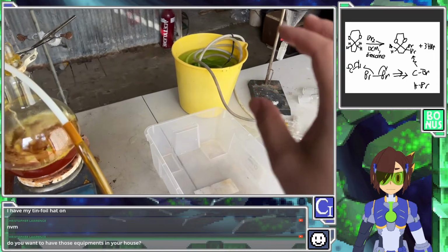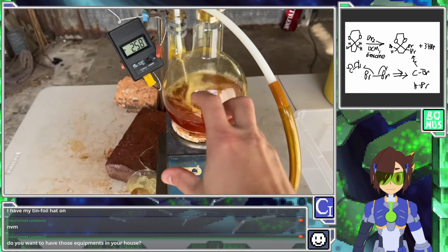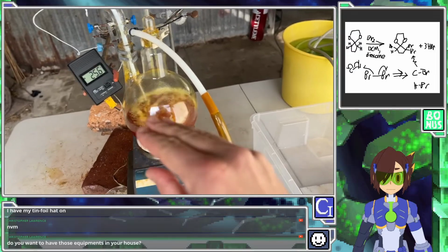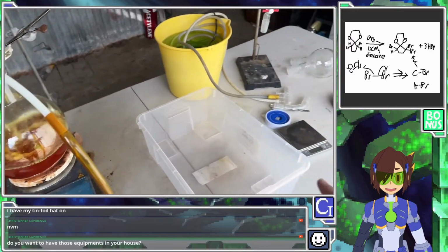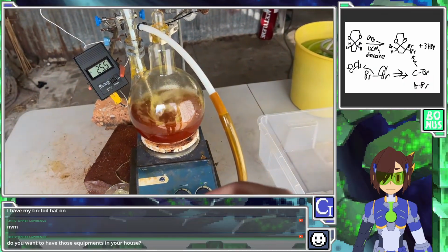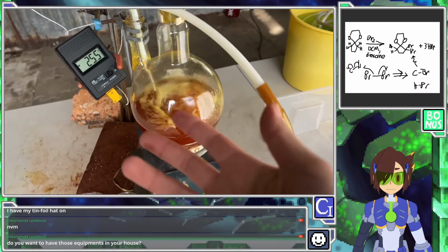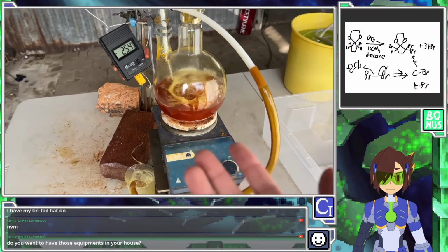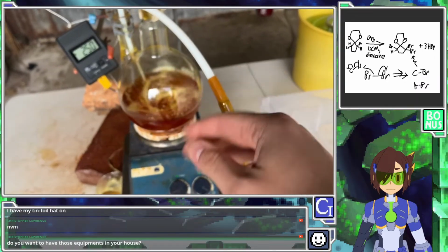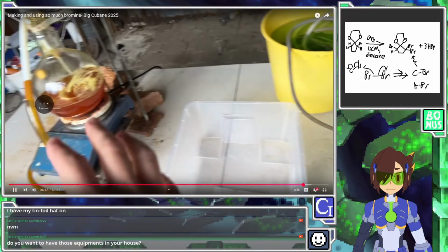We've got to separate it off, which is a little bit difficult because there's so much of it, and there'll be quite a lot of water as well. But once we have that by itself, without the water layer, it's a good amount to work with. At the very least, you won't have nothing. Distill the dichloromethane off to be left with a residual oil. Should crystallize out into our tribromo product. We're distilling it once we've removed any residual bromine or hydrobromic acid. It shouldn't really be an issue.